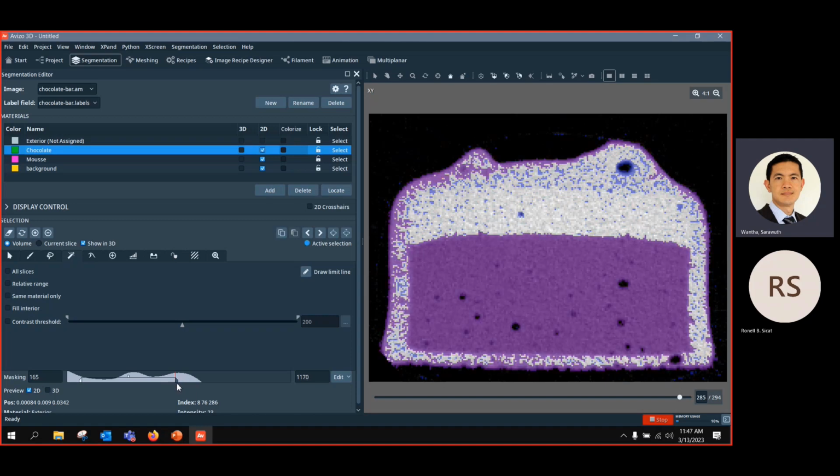But this one is difficult because it will be like this. We are always connected in 3D. So, if I click here, you can see this. Here, you can see this. Only this region is selected because it is connected through the region growing of the intensity where I click.